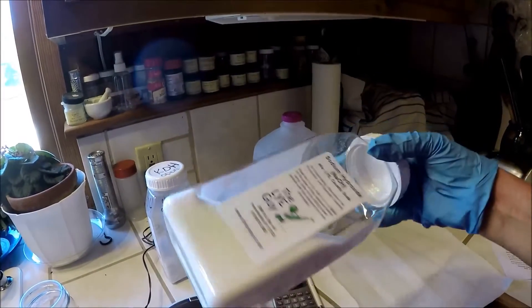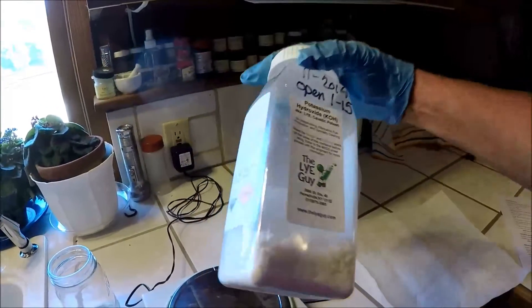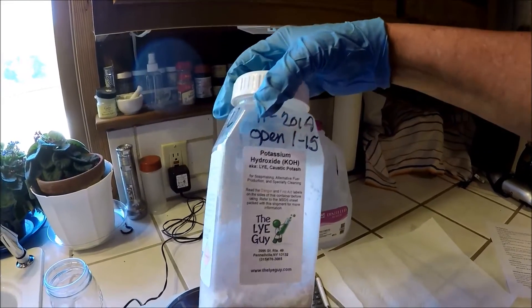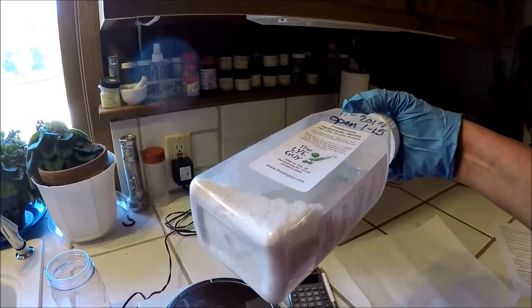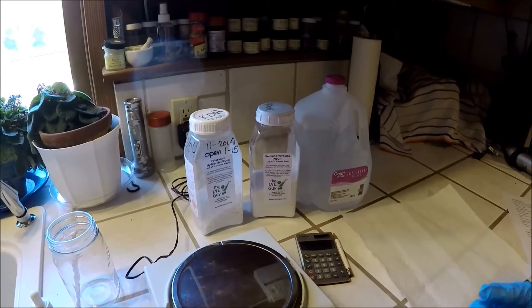My sodium hydroxide comes in a bead form. And I also make liquid soaps, so I use potassium hydroxide or KOH, also from the lye guy in New York state. It comes in the form of a flake. I want to know in either case whether my lye is pure enough.